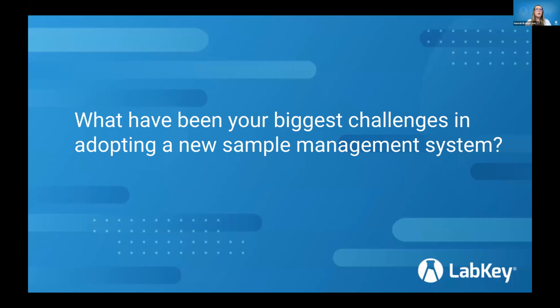Sharing samples and doing work across labs. How does that work with Sample Manager? There are a few different ways to do this, and we actually have some things going to be built out next year to help support this even more. But typically for that shared work, you can each have your own version of Sample Manager, and the import and export will work very seamlessly. Or you can have something a little bit more large scale and go for the higher version of Sample Manager, where you might be able to have multiple sample managers on the same instance. I think we'll hear from some groups about that today.